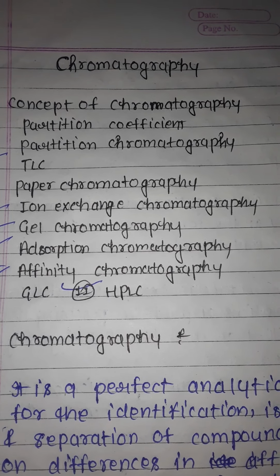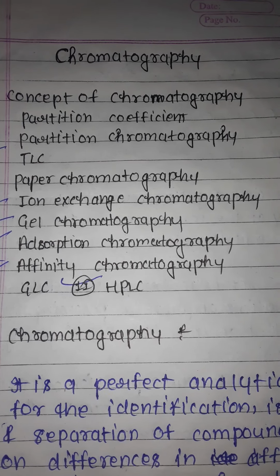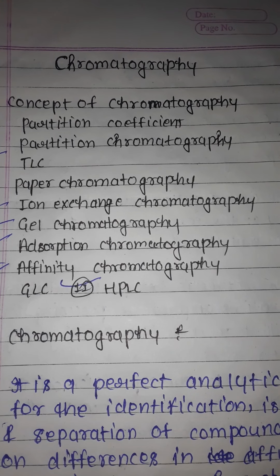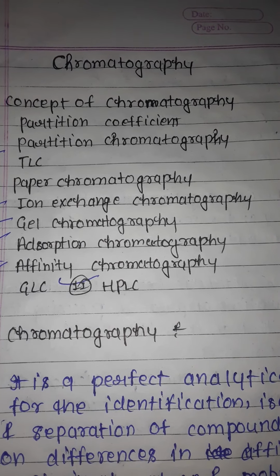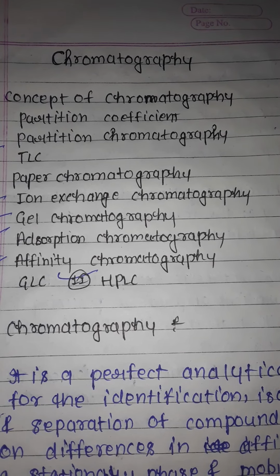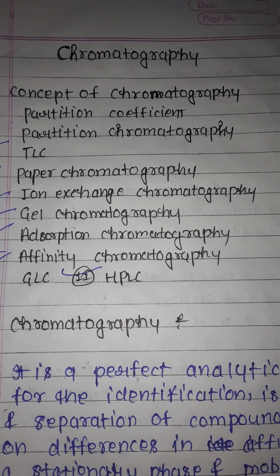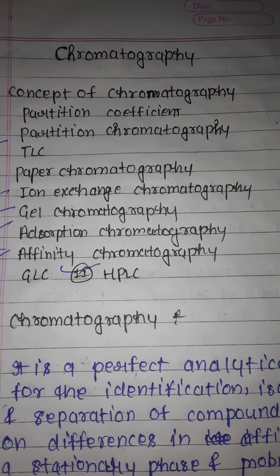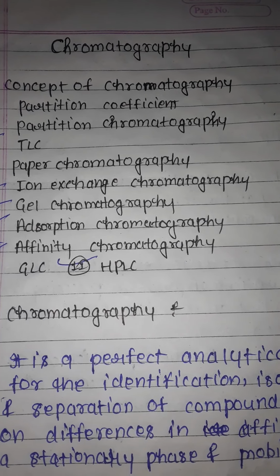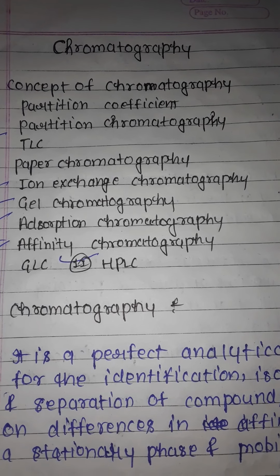These are some parts of chromatography. We can cover the concept of chromatography, partition coefficient, partition chromatography, TLC, paper chromatography, ion exchange chromatography, gel chromatography, adsorption chromatography, affinity chromatography, GLC, and HPLC. So today we are going to cover chromatography. In that we will cover partition and adsorption.